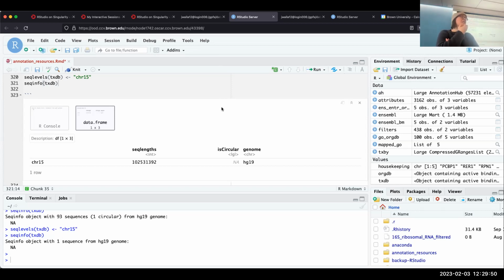Or, sorry, now I'm tacking on, if you have to filter out, say, one annotation set that's really the canonical set, but then there are maybe pseudogenes. Yeah, and sometimes, and I sort of glossed over it, the gene annotation conversions aren't always one-to-one. I showed an example where they were one-to-one, but sometimes they're not.